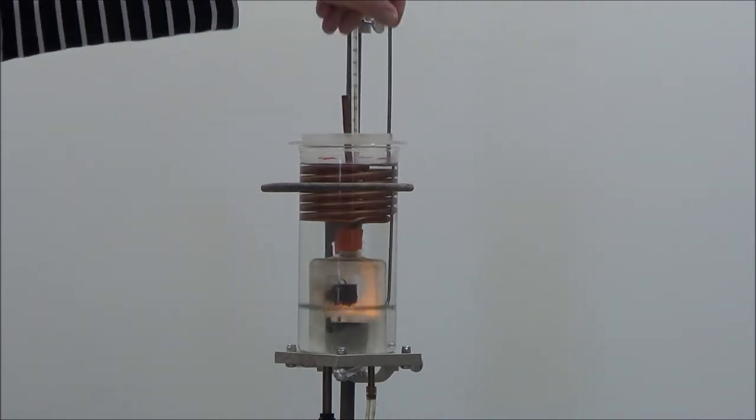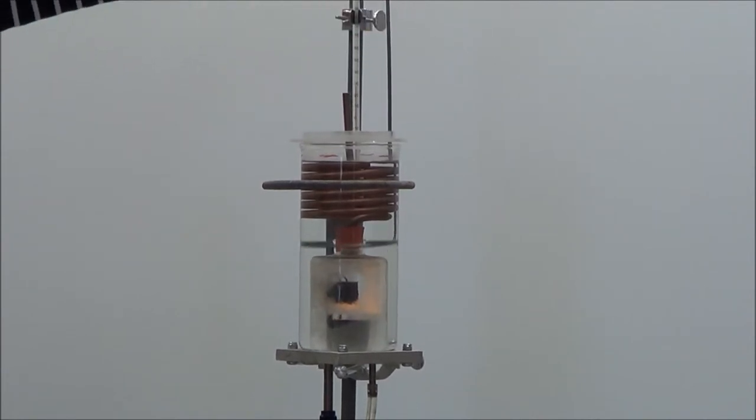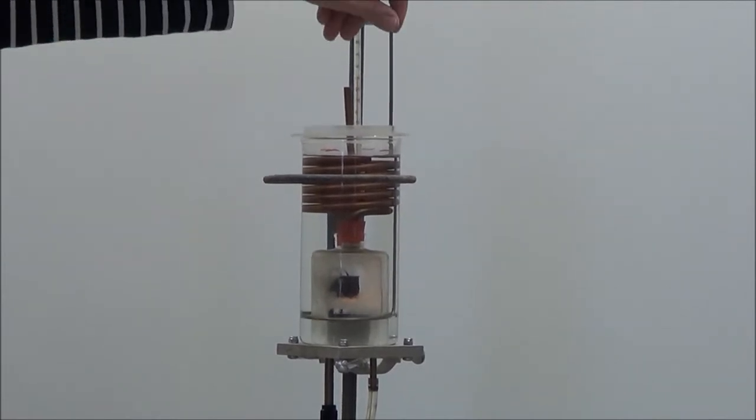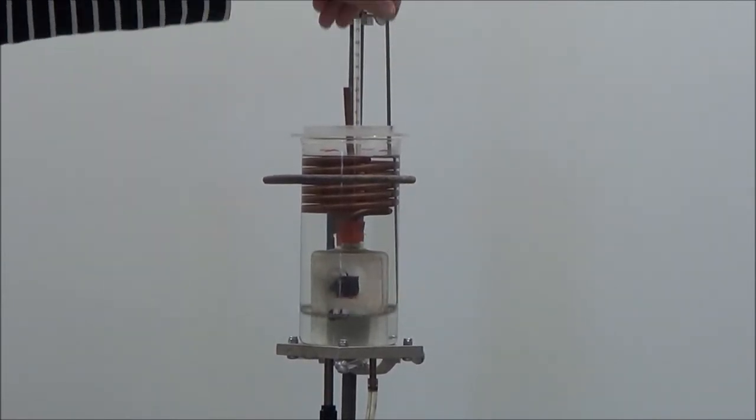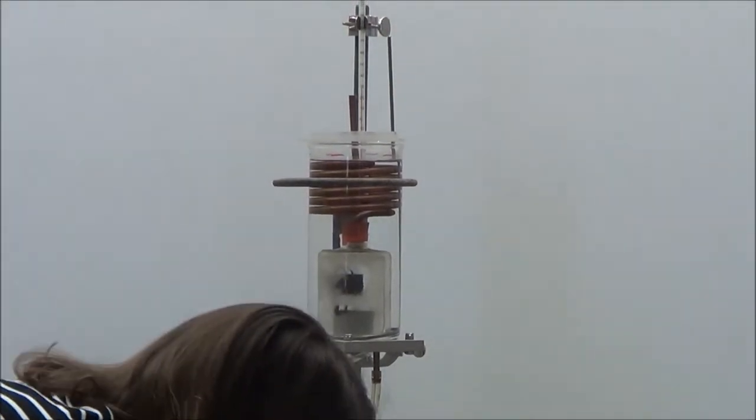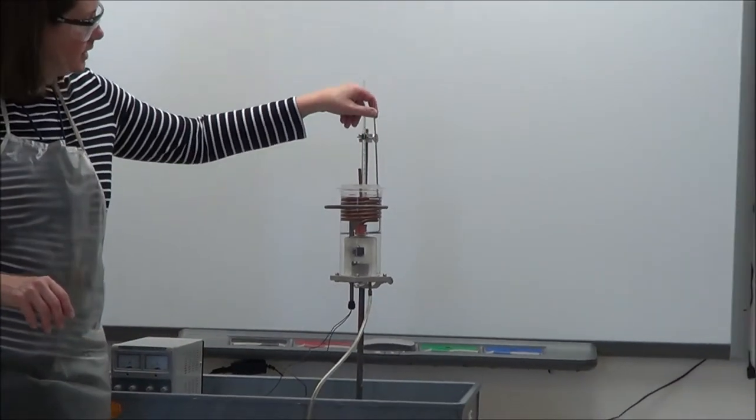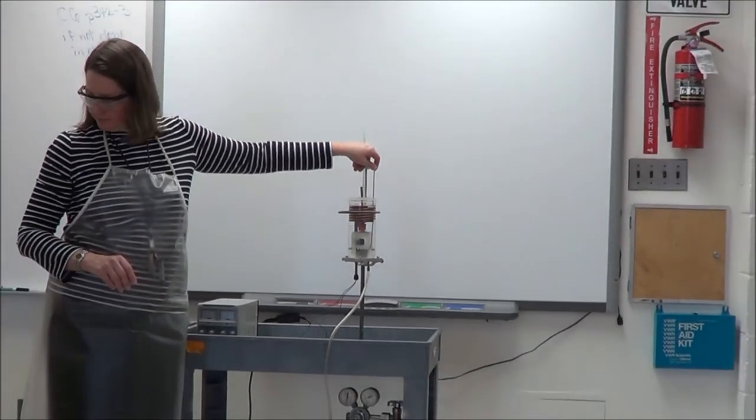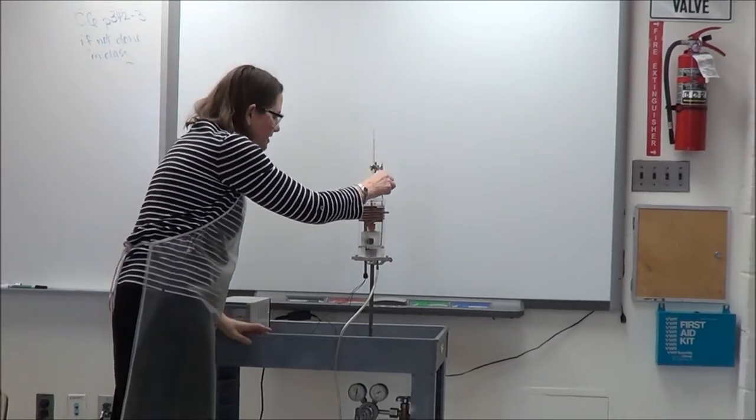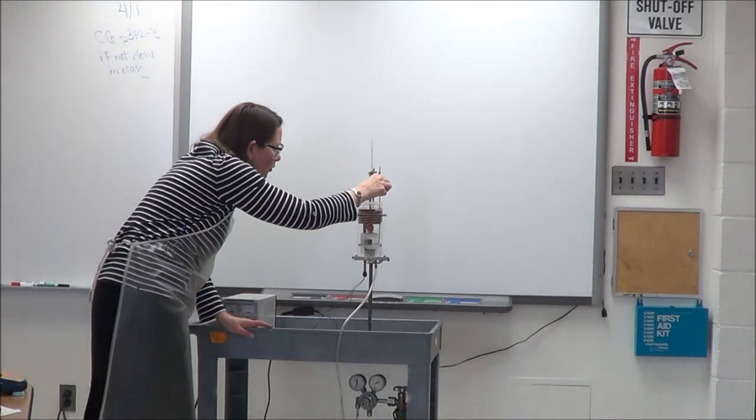We're going to let this burn completely. Looks like it's starting to fade down a little bit. When it stops, I'll turn off the oxygen. But then I'll keep stirring until I get the highest temperature reached. So the burning has stopped. I'll stop the oxygen, then continue stirring. And I want to continue stirring until the highest temperature is reached to make sure that all the heat released from the bread has gotten into the water.